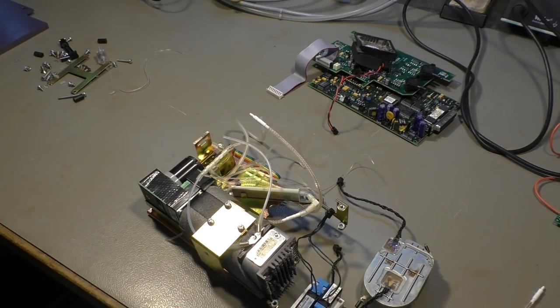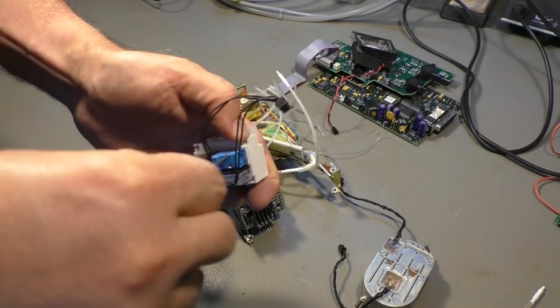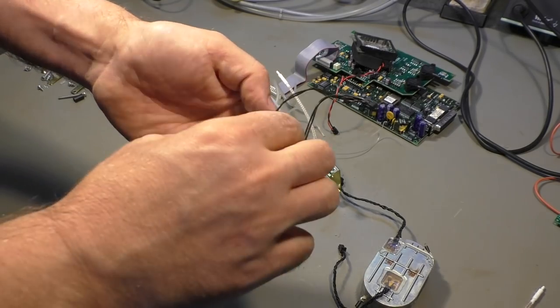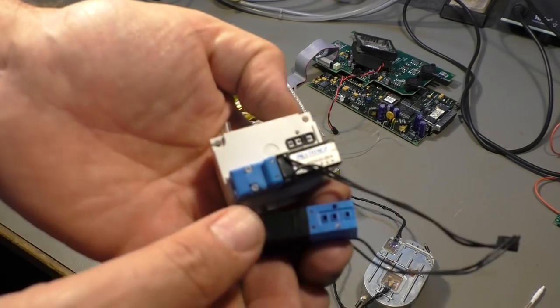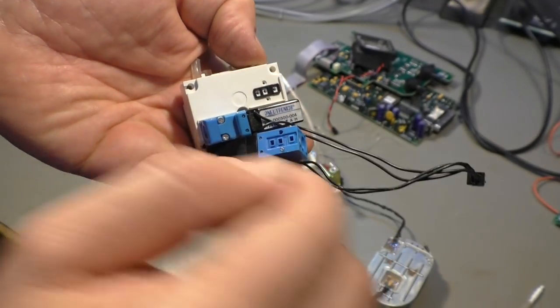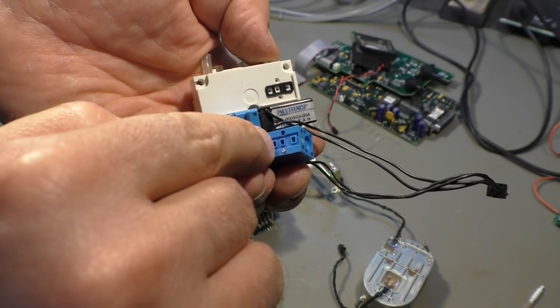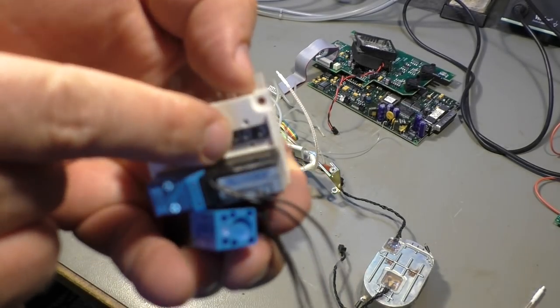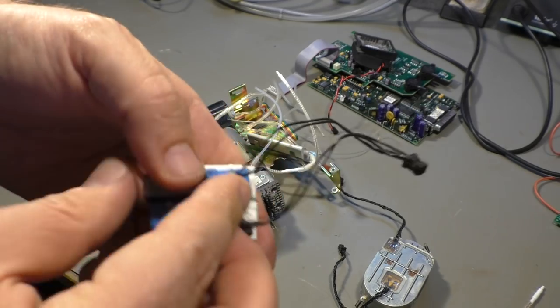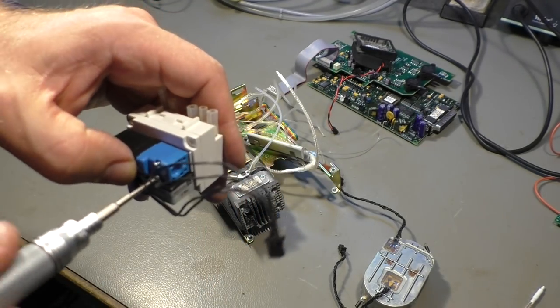Well, why not take a smaller screwdriver and have a look how they work? Maybe we can see something. Let's remove one of them. So the ports are here. You see that? We have three holes. So I think that works like an electric switch. One is the common, and then it switches to that or that hole. I don't know what exactly. There is a gasket. Yeah. Going like that. And the other one is certainly exactly the same.